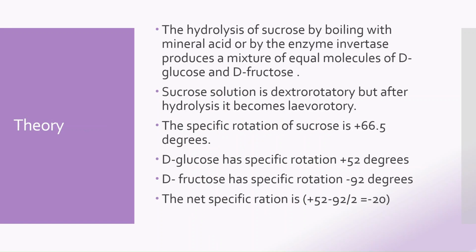Let us have a brief theory here. We just looked at a lecture on simple syrup and how to prepare it, and here we are talking about invert syrup.